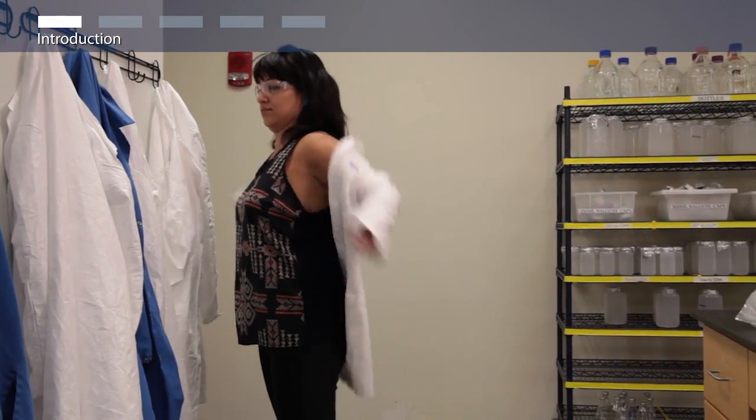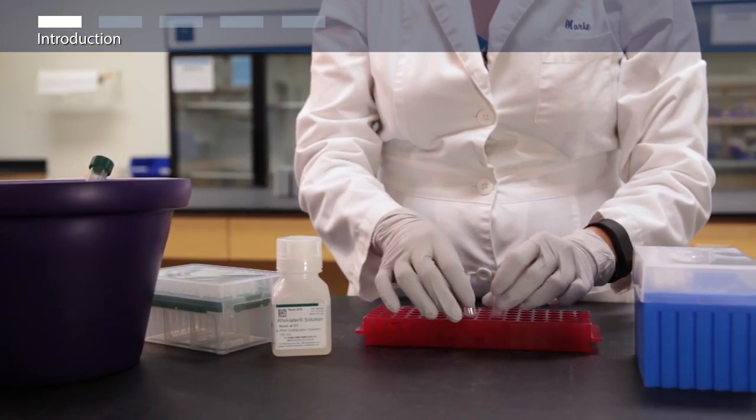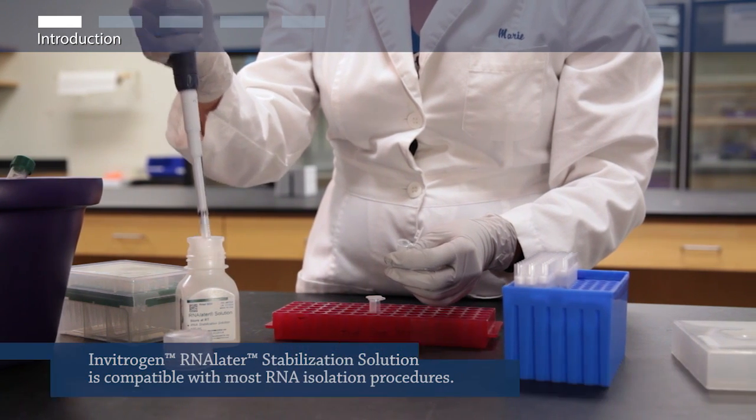RNA-Later Stabilization Solution rapidly permeates most tissues, stabilizing and protecting the RNA in fresh specimens. It eliminates the need to immediately process samples, freeze them in liquid nitrogen, or rush them to the freezer.